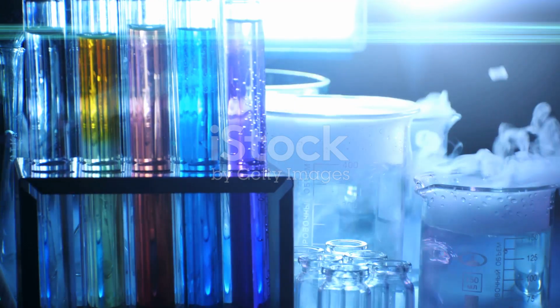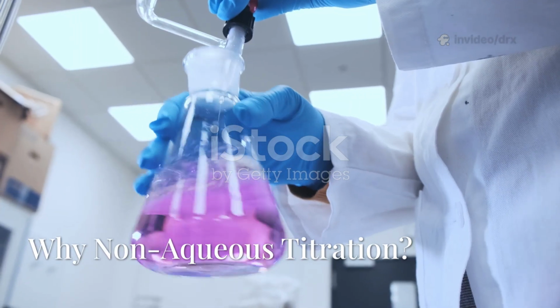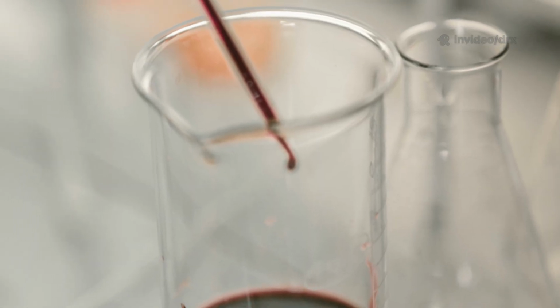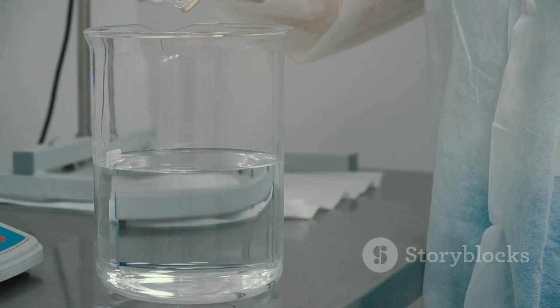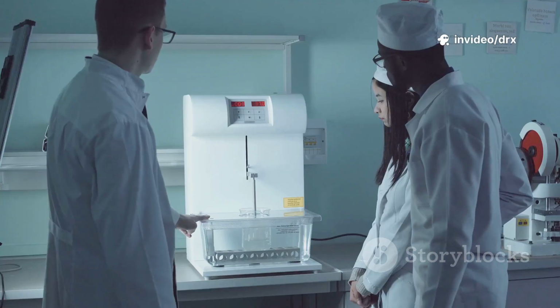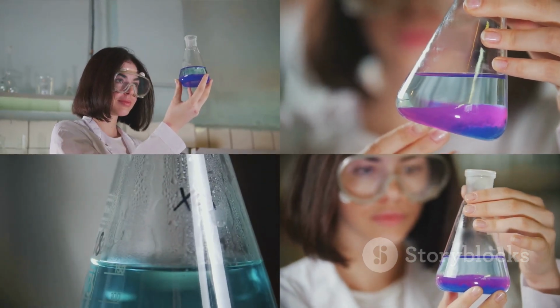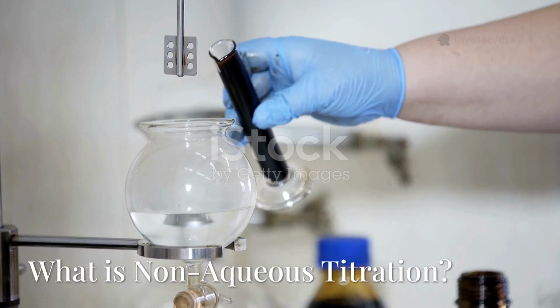Today, we are going to dive into the topic of non-aqueous titration. Non-aqueous titration is an important analytical method used to determine the strength and purity of weakly acidic or weakly basic drugs that cannot be titrated accurately in water. So, why do we need this method? Well, it's because some drugs are poorly soluble in water, some are very weak acids or bases, and others undergo hydrolysis in water. Therefore, we use non-aqueous solvents instead of water.